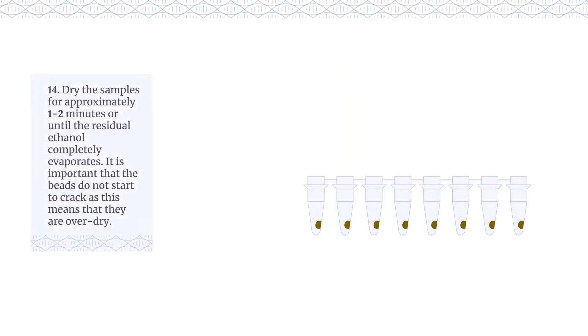Dry the samples for approximately one to two minutes or until the residual ethanol completely evaporates. It is important that the beads do not start to crack as this means that they are over-dry.